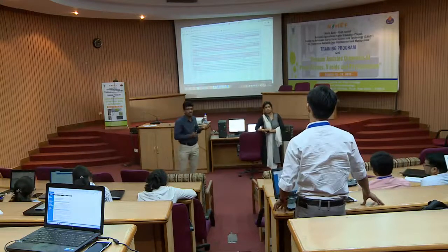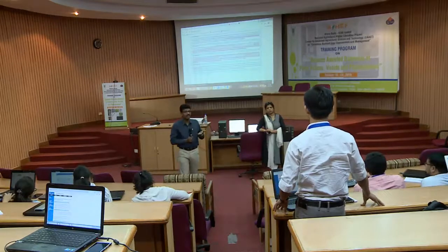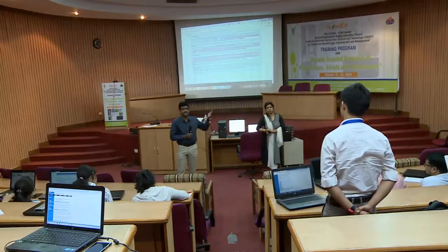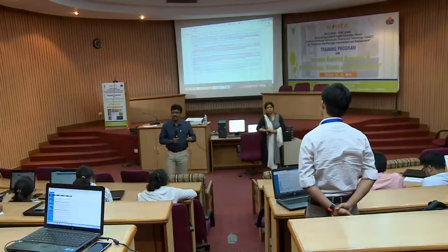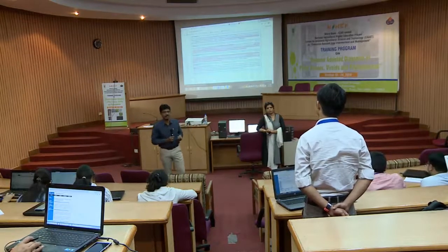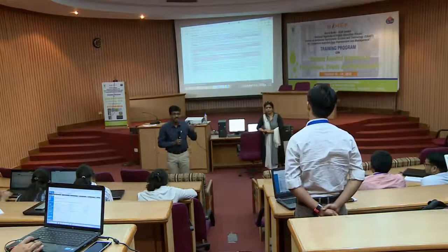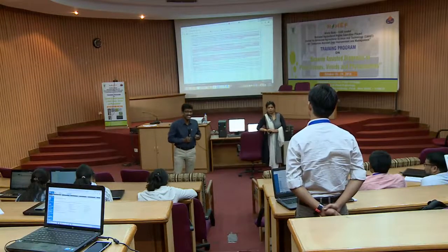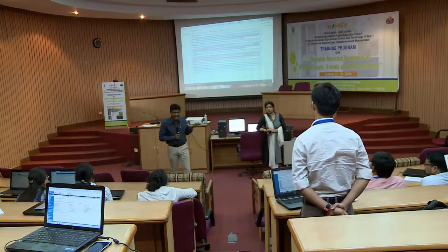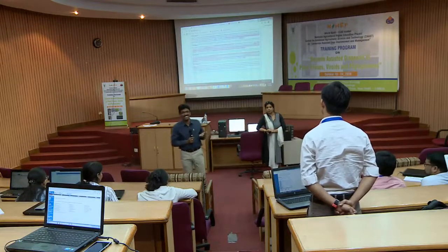The beauty of this database, again, is that the databases are managed by people like us only. They have to take out their time to maintain those databases. The highlight of those databases, in the case of PAMDB, because I really populated a lot of data there, is what they ask for: not your sec file or FASTA file. They ask for your chromatographic file, because the chromatographic file will not lie; it is the real file coming from the machines, right?